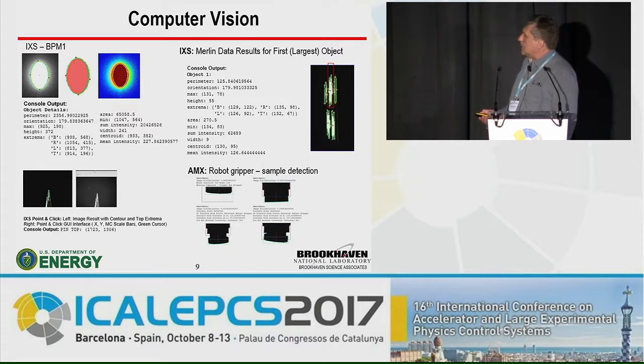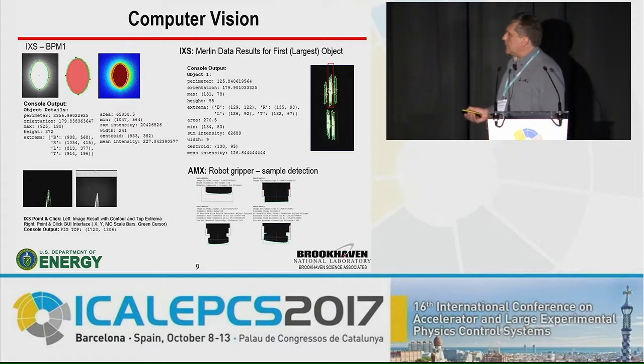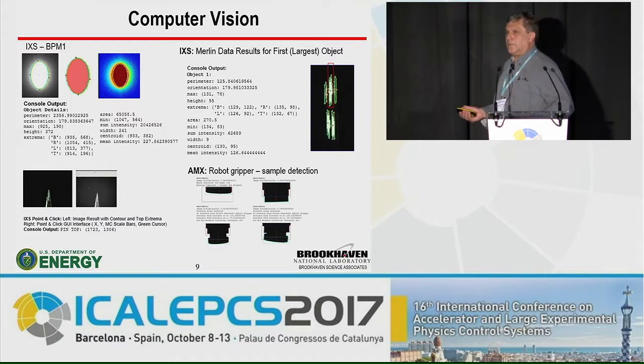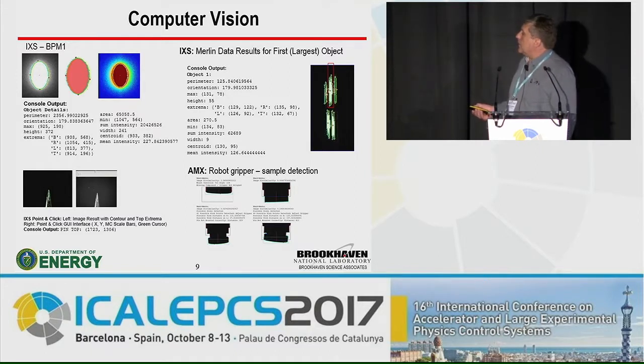Application in robotics, we are looking at how the robot grips the sample. And then what is important is this similarity parameter, which you probably cannot see, but this parameter is basically a value from 0 to 1, which actually tells whether the mounting is good or not.